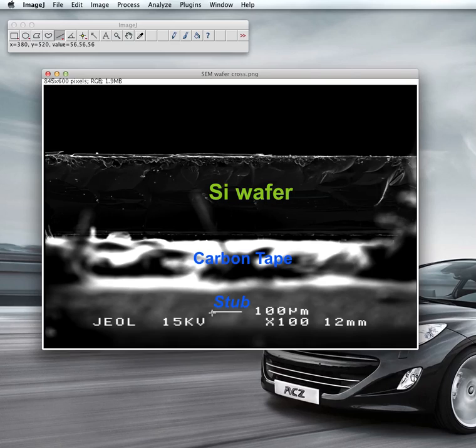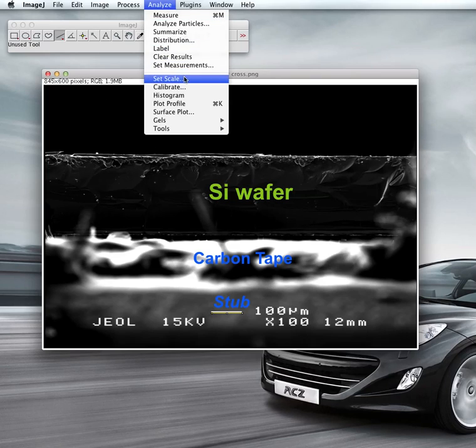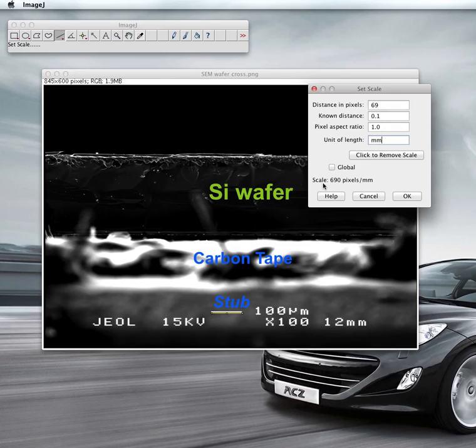Draw a line — try to make it as accurate as possible. Get a straight line from one end of the scale to the other. Then go to Analyze, Set Scale. The distance in pixels along this line will appear, and you need to set the known distance to 0.1 mm, with the unit as millimeters — so the scale will be 690 pixels per millimeter.